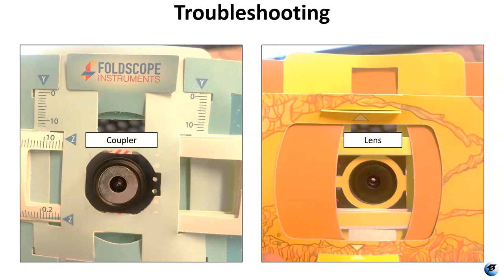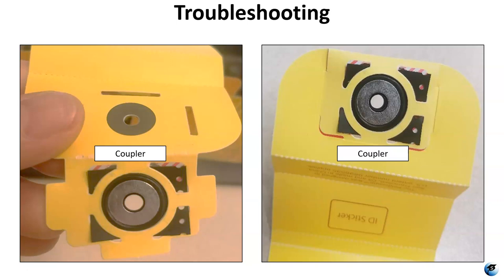The sticker and paper hold those two things together so they're not just attached magnetically. I found out the hard way that if you don't attach it correctly, every time you couple your phone to the lens it will pull the lens out of the Foldscope. If you're having that problem, that's an easy fix. For the other coupler that goes on the flap, make sure you're putting it in correctly — covering the little red and white dashed lines — so when you fold it over everything lines up.